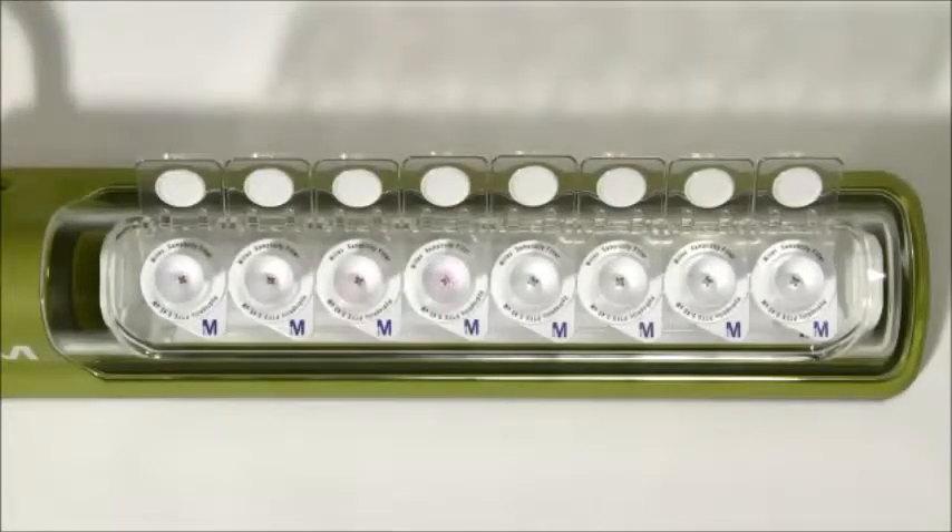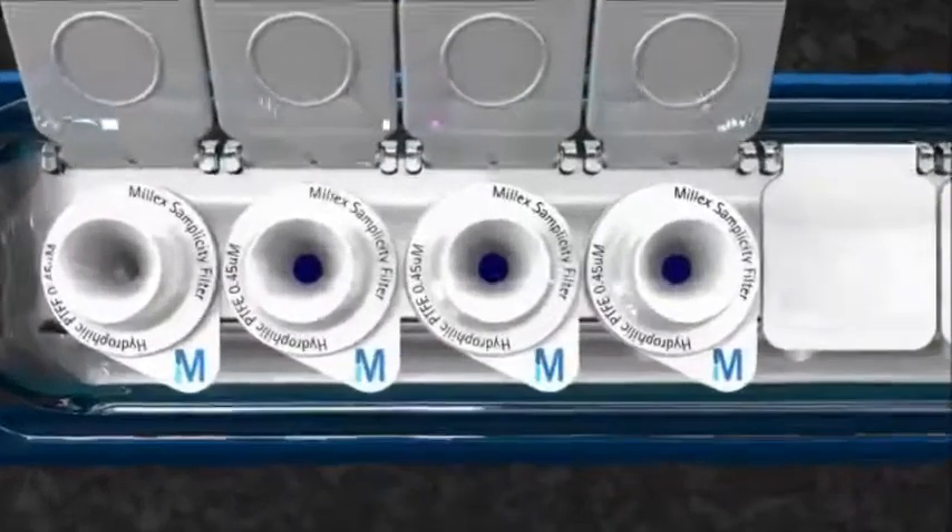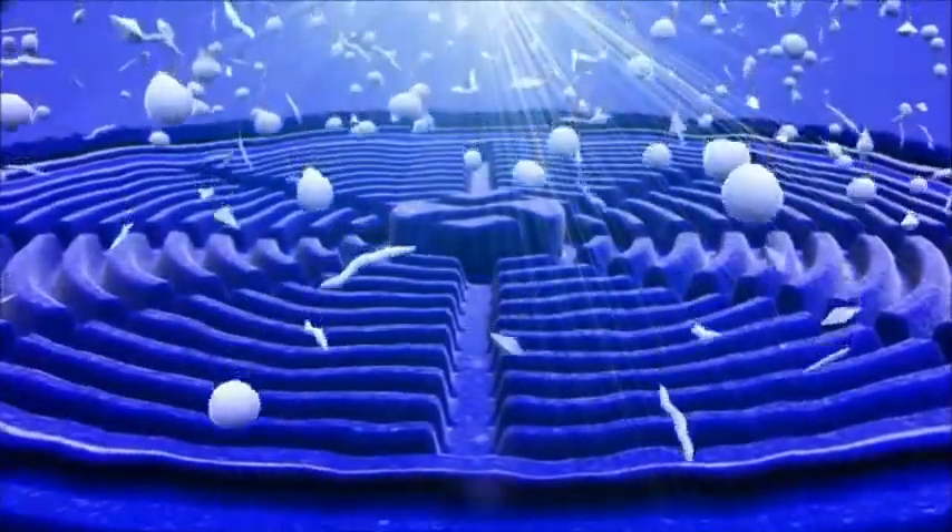Once the sample is loaded, you can simply press the lever to turn on the vacuum and watch your samples get filtered into the vials.